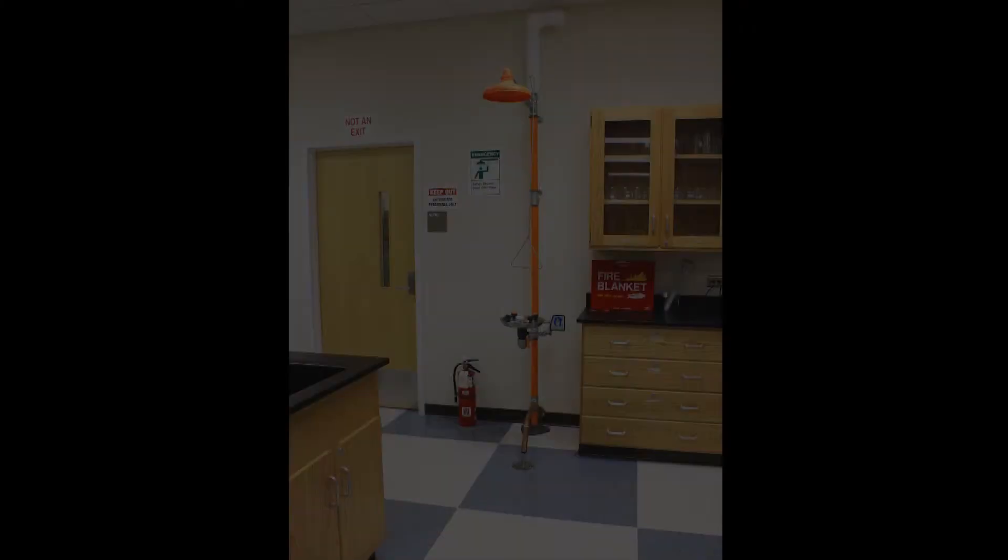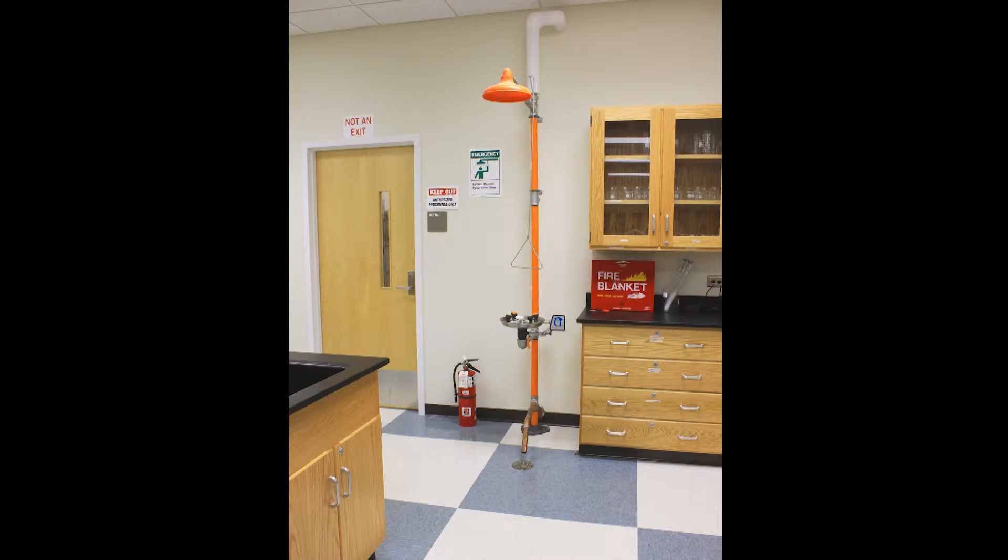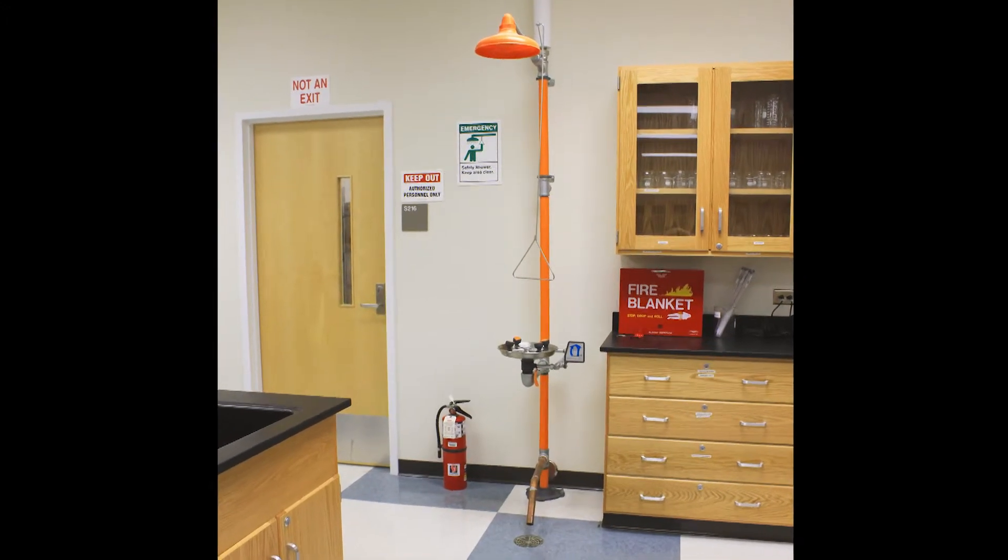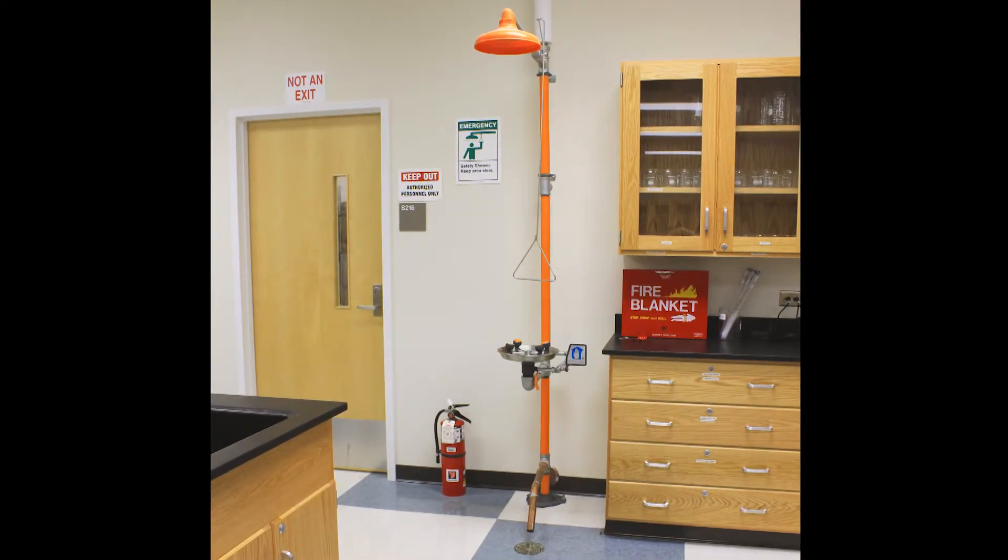Notice the location of the emergency safety shower and eyewash stations. The safety shower is appropriate for use when a person has been exposed to a large chemical spill on themselves or their clothes, or when their clothes have caught fire. The eyewash is appropriate for use when a person has splashed chemicals in their eyes.